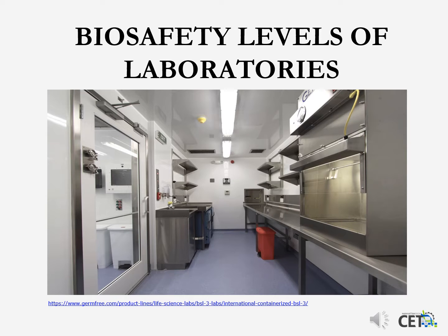To give you an overview of safety levels of labs, the next few slides will be the interior pictures of BSL 1 through BSL 4 labs, and then I'll describe the design and mechanical features.